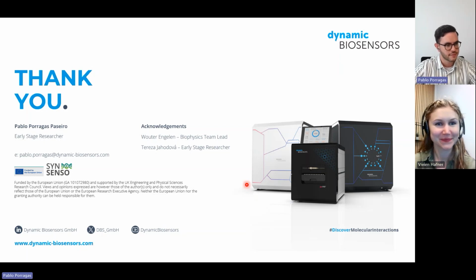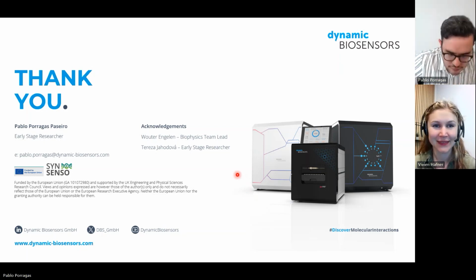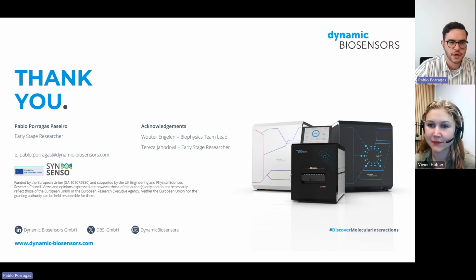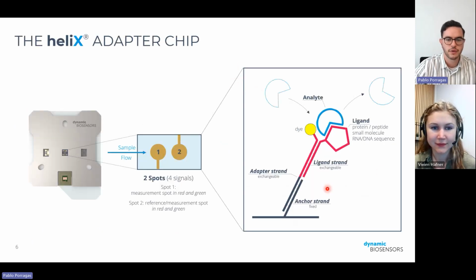Yes. And so is there a way to use this technology to get some kind of binding constants of a ligand to a protein? Yeah, so as I showed here, we have another technology where we can look at just the on and off rates of an analyte binding to whichever ligand you're interested in as well.